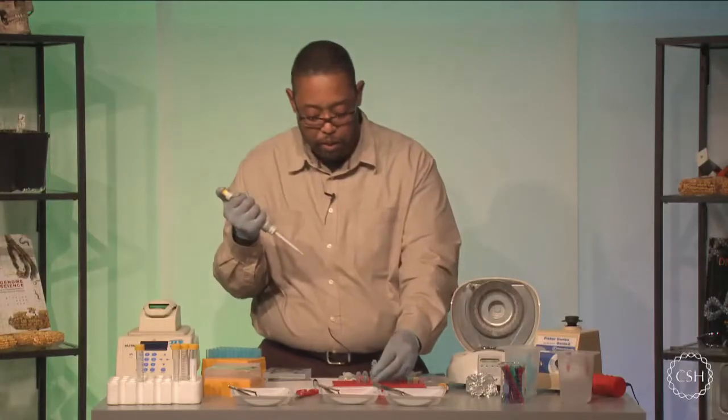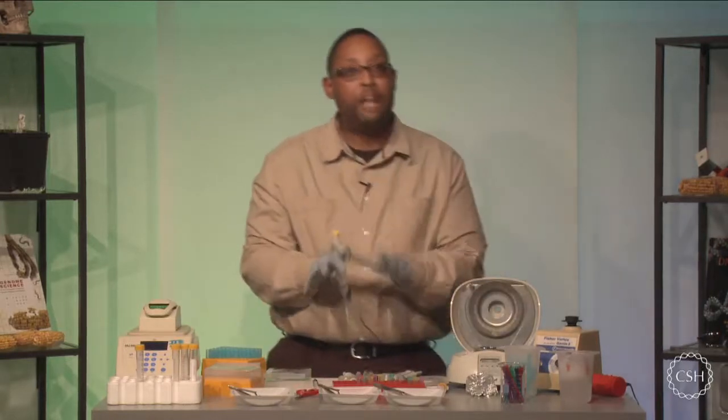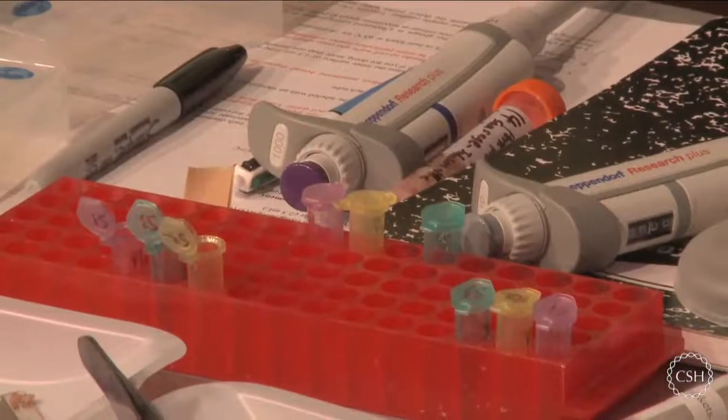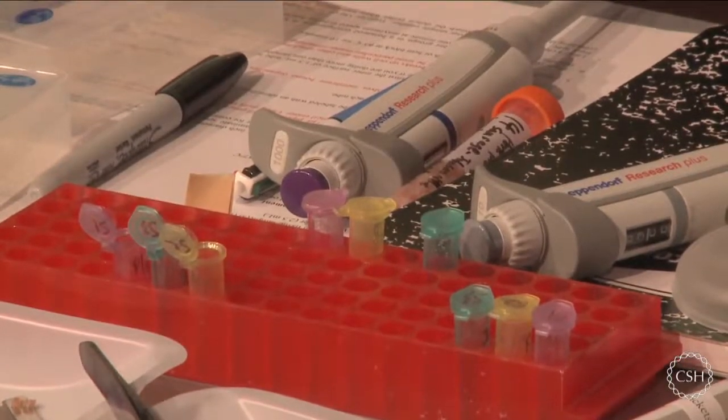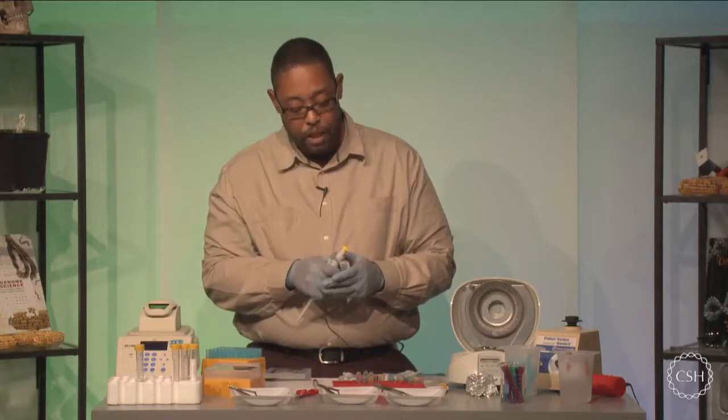So I've removed the last bit of wash buffer from my last test tube. At this point, you can allow them to sit to dry for about that 2 to 3 minutes, which will allow most of the alcohol to physically evaporate off. At that time, you can then move to eluting the DNA off of the silica resin.